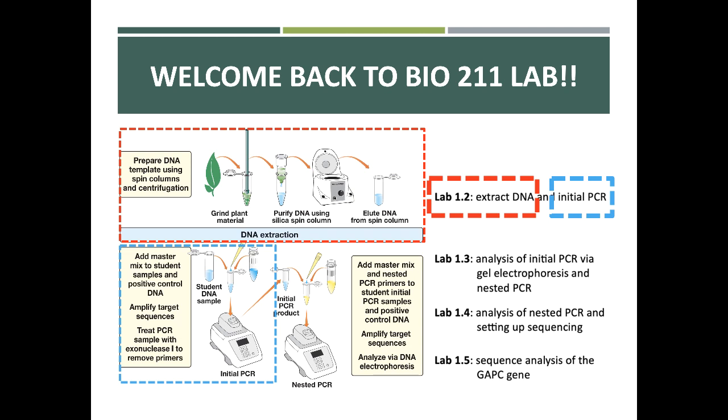In this module, you're going to learn about how we extract DNA from tissues. In this particular case, we're going to learn about extracting DNA from plant tissues. But the process isn't much different if you're going to extract it from other tissues. Now, plant tissue does turn out to be a little harder to get DNA from than, say, an animal cell because of the cell wall. But the process is very similar.